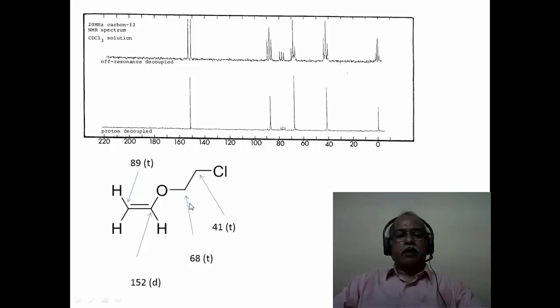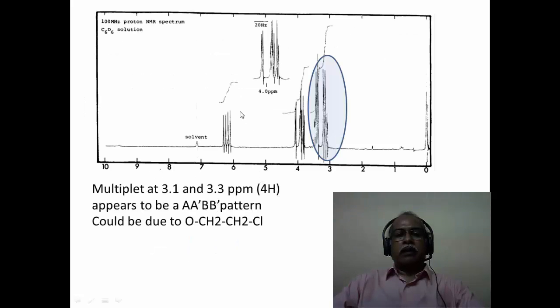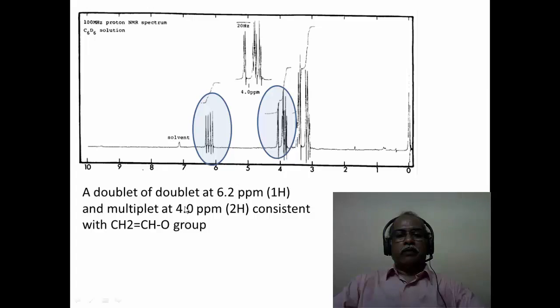And in the proton NMR spectrum, although we have not analyzed it very carefully, this doublet of a doublet seems to indicate that there is a vinyl group present in the system. So it was identified from the proton NMR spectrum, and it is corroborated with the data from the mass spectrum. This region was not expanded and interpreted because it's a fairly complex second order spectrum.